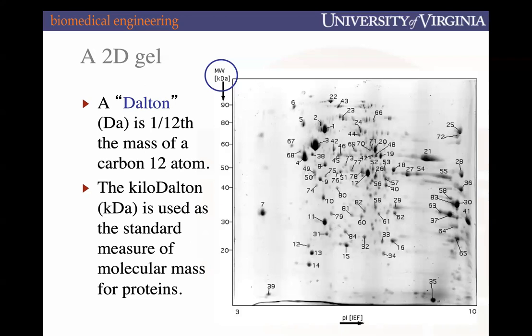The ones at the bottom of circle 3 or circle 4 might not be glycosylated, or sorry, the top. Forgive me, I'm twisted up today. The bottom might not be glycosylated. The heavier ones might be more glycosylated, or it could be some other modification that's changing their molecular weight just by a little bit. And over here, for sample 21, is there another horizontal smear? 37 has a wide one. There might be modifications that are changing the charge of that protein. One possible modification is a phosphorylation event that will change its charge. Does that make sense?